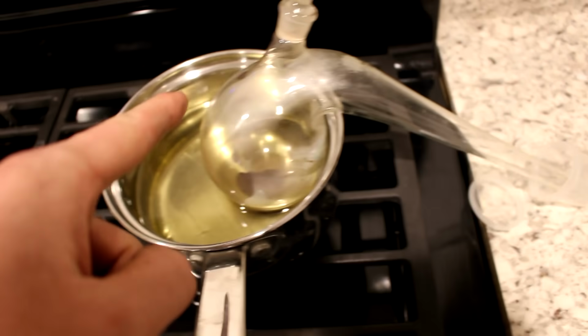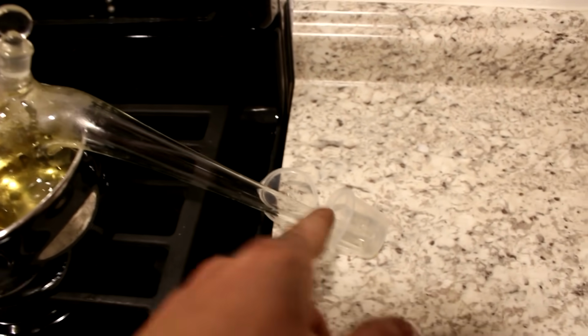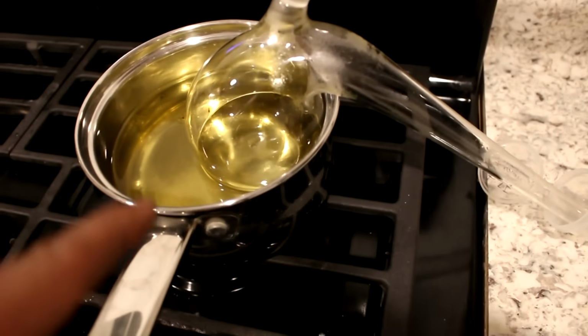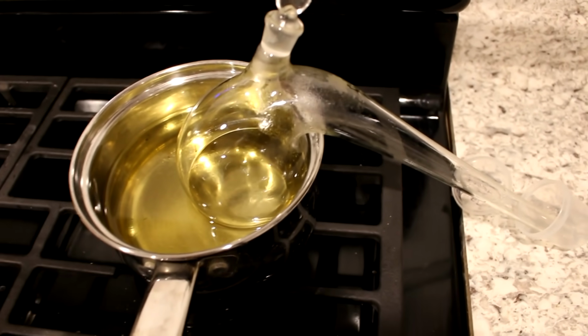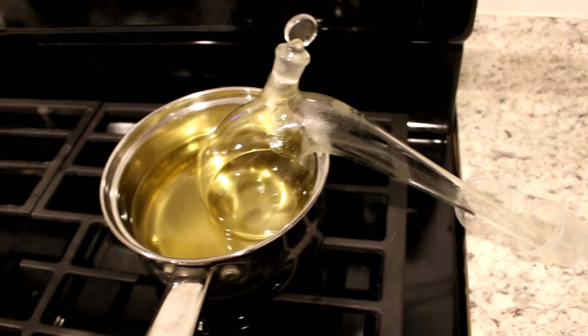Looks like I got, well, that much there. I mean, I got rid of that much. So I'm just going to distill the water out into this little cup. So I remembered to distill out the Fiji water and sodium hydroxide mixture. That way I get rid of the sodium hydroxide. So I thoroughly cleaned and dried this thing, and now I'm running that sample. Just so I got something that's actually just pure water.